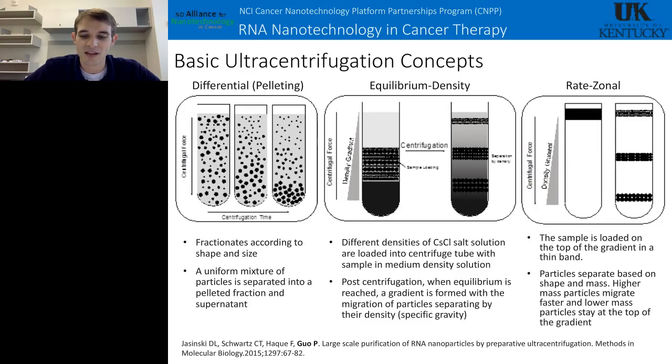It's the same type of thing where the particles flow continuously in this rate-zonal gradient, and then they separate based on their sedimentation rate. So larger particles will sediment faster than smaller particles, so you'll be able to separate your particles based on size.